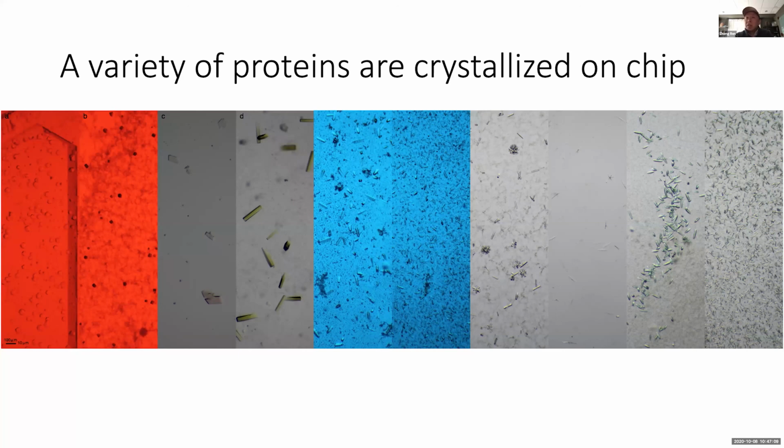And successfully, they're doing a really good job. Not 100% though, but a very decent percentage of them can be recycled. Because nothing is going to happen to that material. It's literally just like glass, except it's made very thin, so it may be fragile.